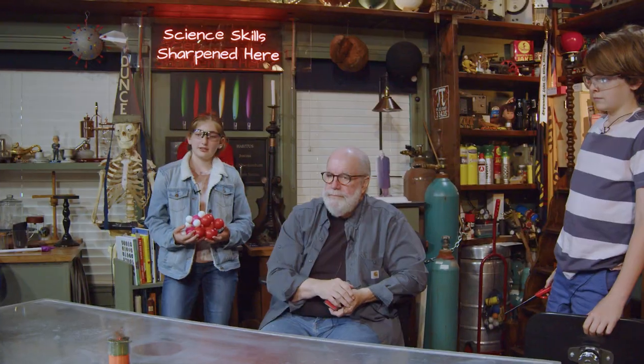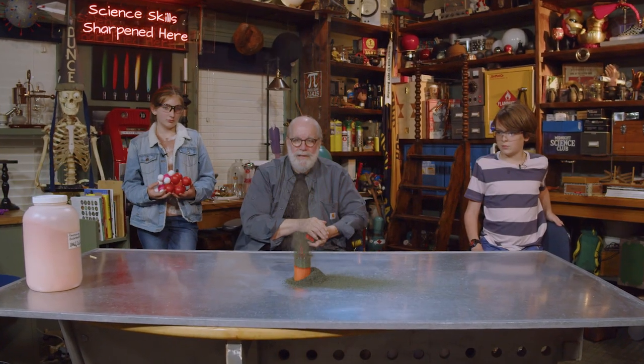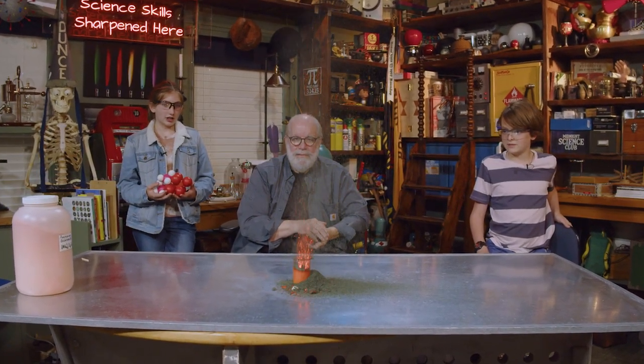That's a little volcano. It is a volcano. It's making a neat noise, isn't it? Giant chunks! Holy cow. Have you ever seen anything like this? No, I have not.